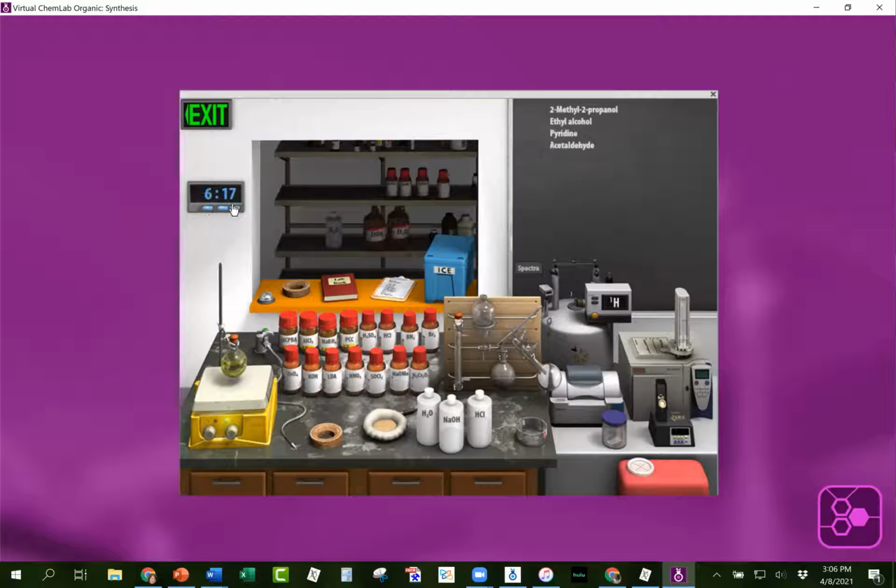As you progress the time here, you can see the reagents are changing, and it tells you what is in the flask. One of the other things that they can see here is that after a while, it's not changing. So they have the ability to see what is in here, and they can do any analysis. They have to do workups. So we have them drag the separatory funnel over.